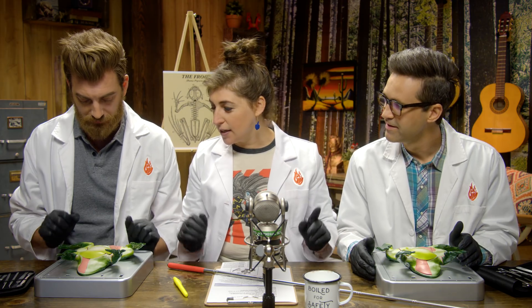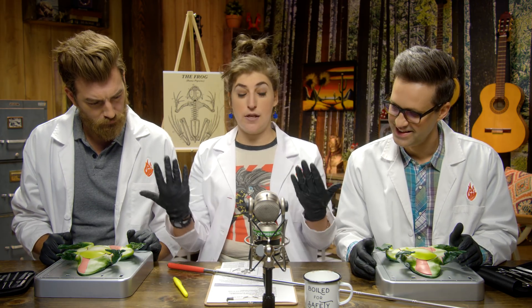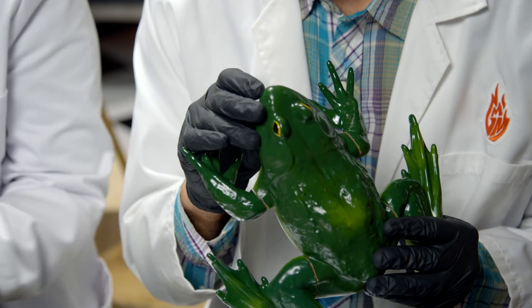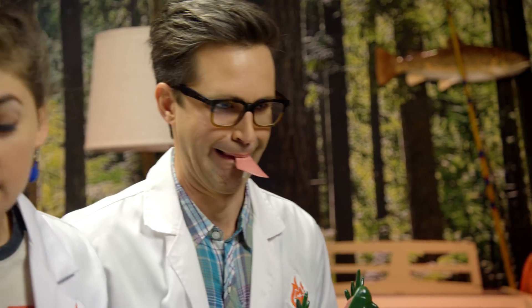Okay, hold on one second. One more thing on our general dissection checklist — please find the mouth and eyes. This is gonna be difficult. Eyes. I found a mouth. I don't know why it's on the list but it's a thing. Found the tongue. It's the tongue! Okay, well let's cut the mouth open.